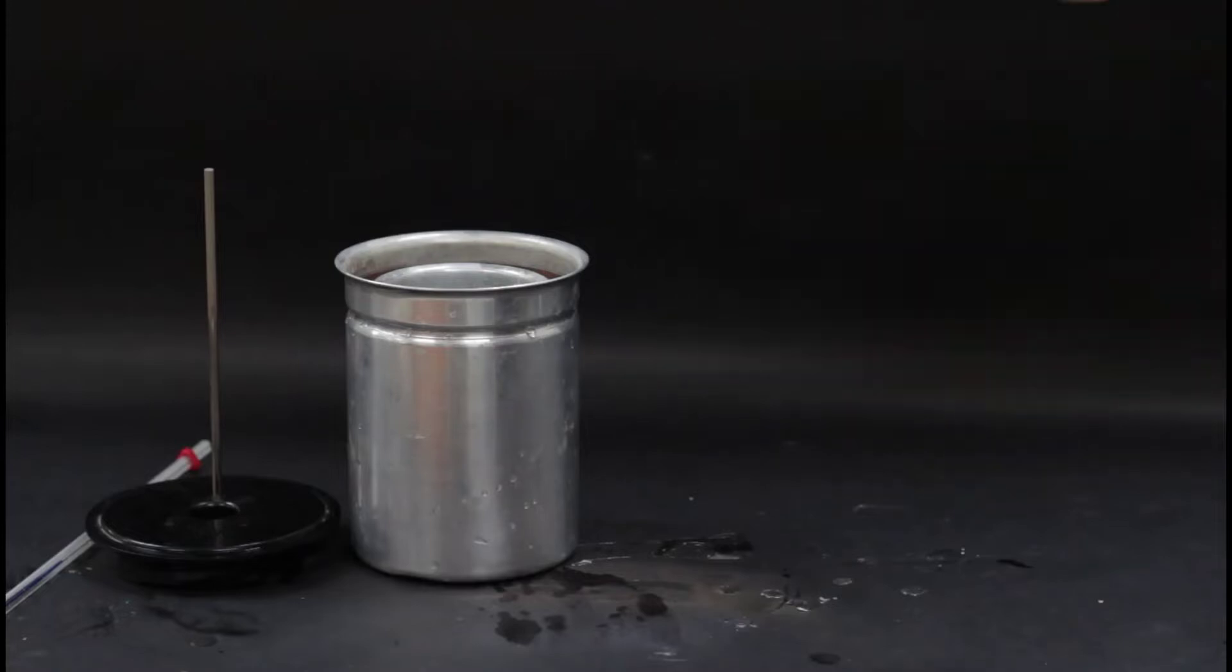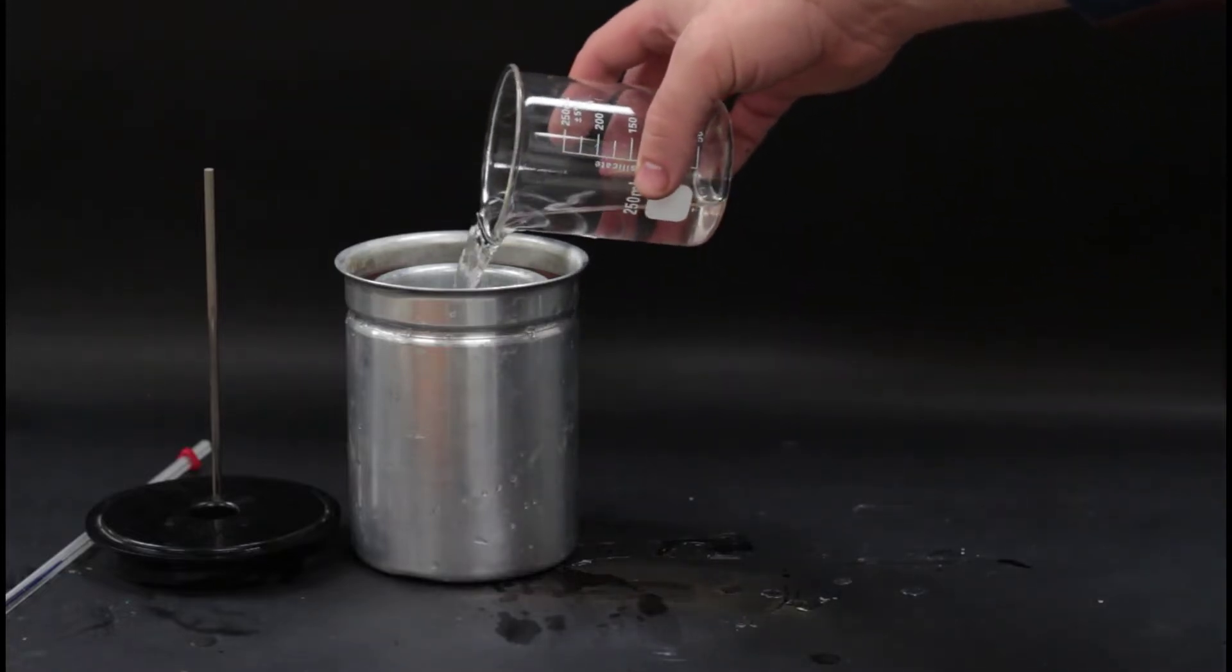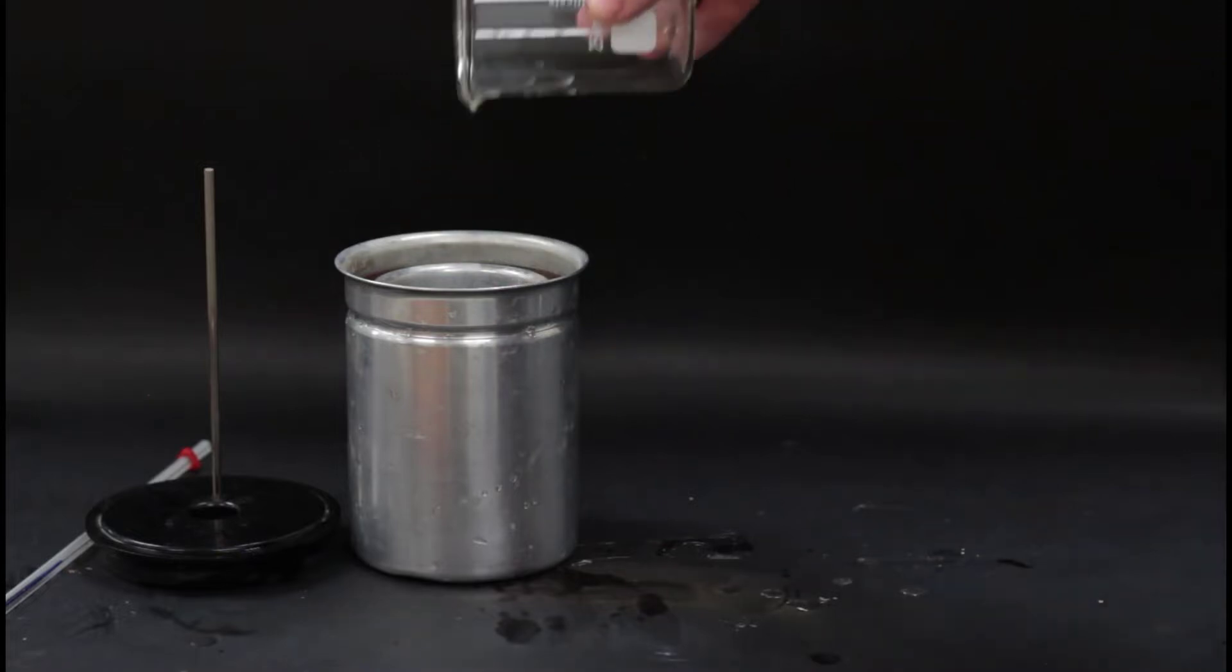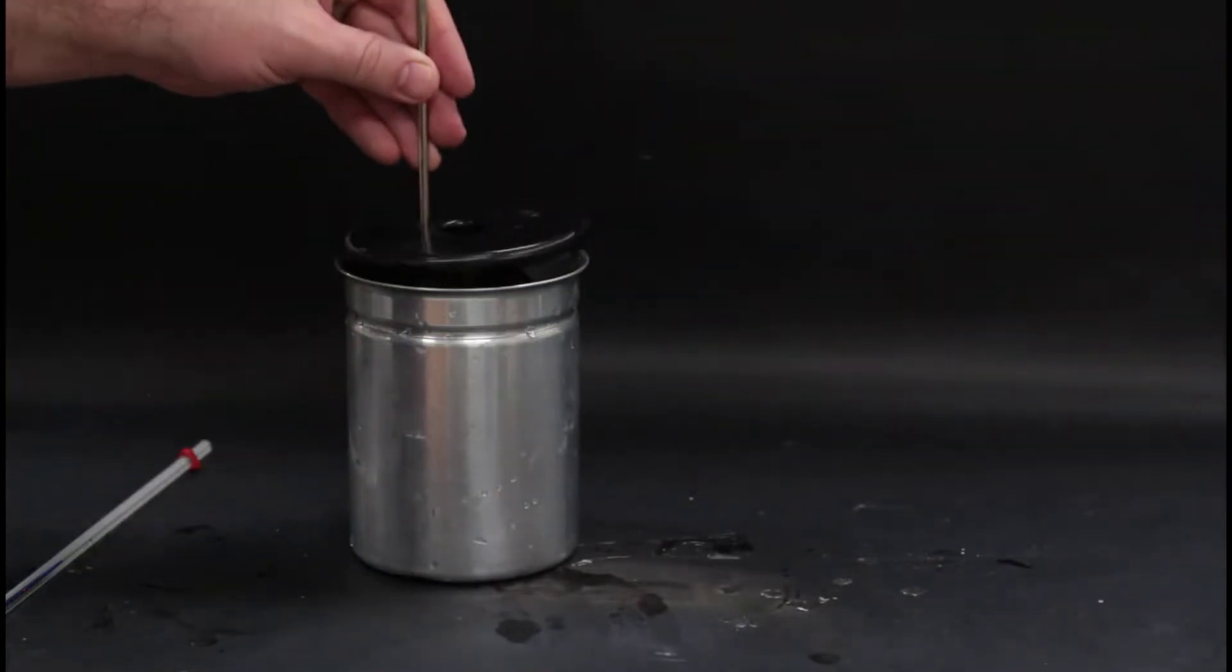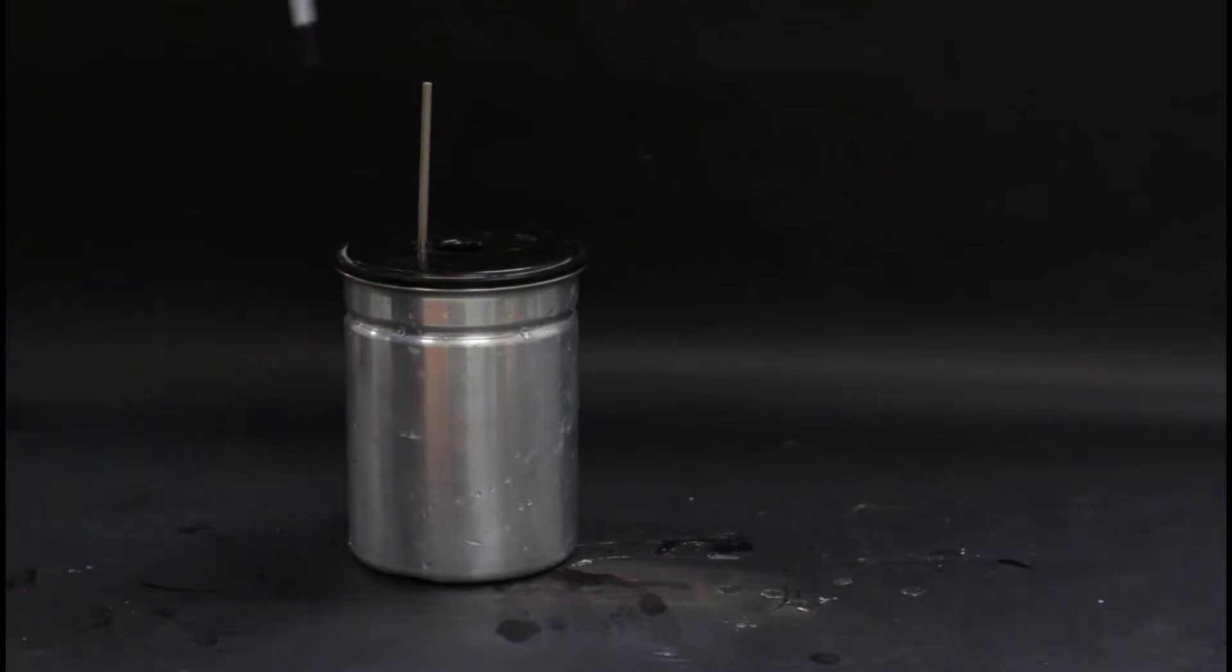For the second part of the lab, fill the calorimeter with another 100 milliliters of distilled water. Measure the initial temperature of the water and weigh the piece of metal. The initial temperature should be room temperature again.